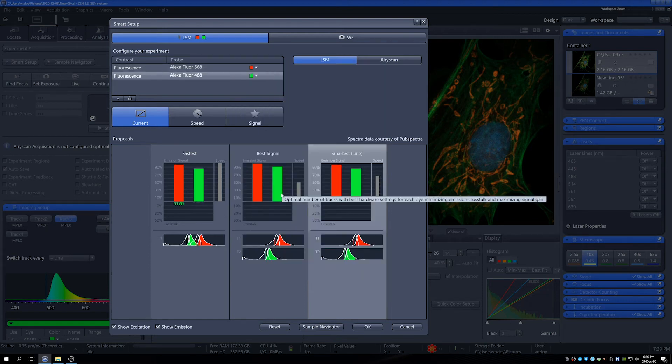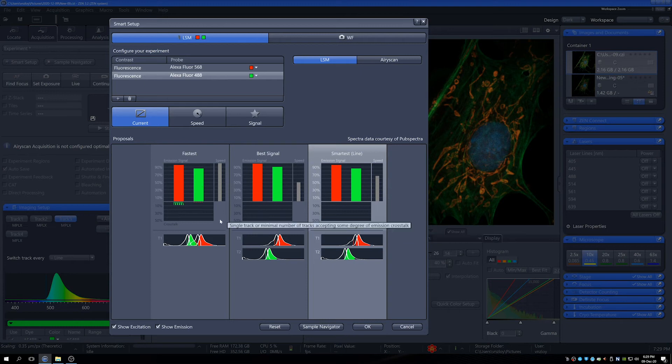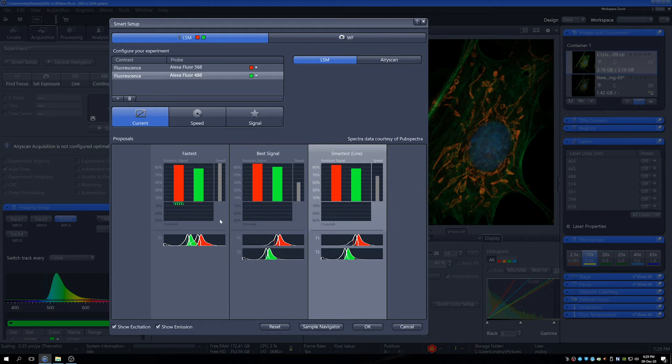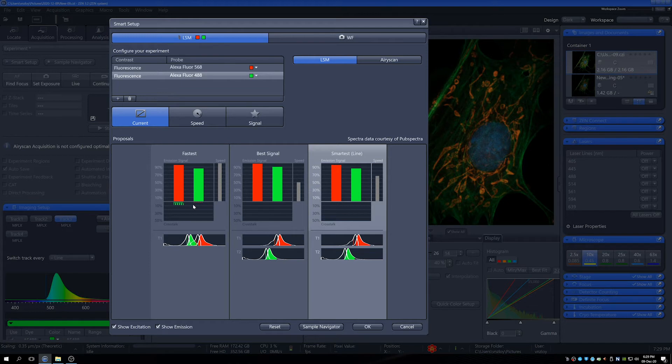Now the system will offer us a number of ways that it can combine these channels depending on what our needs are for those kinds of experiments that we're doing. For things like live cells, the fastest is often an important choice because we want to be able to capture dynamics. But we might get a little bit of bleed through when we do that in the crosstalk. Not the end of the world, it really depends.